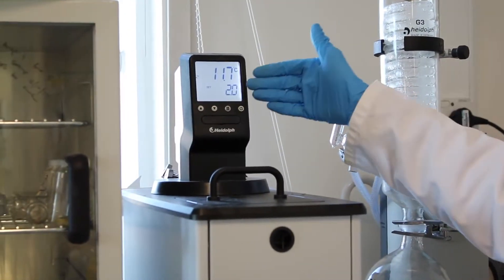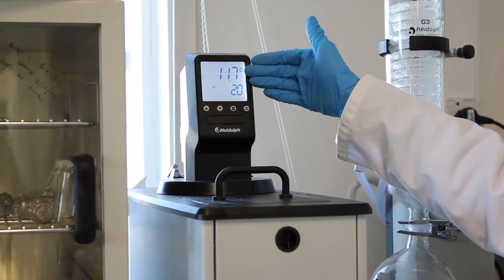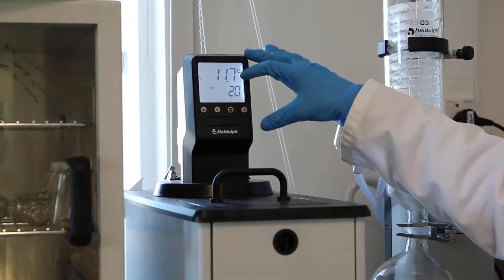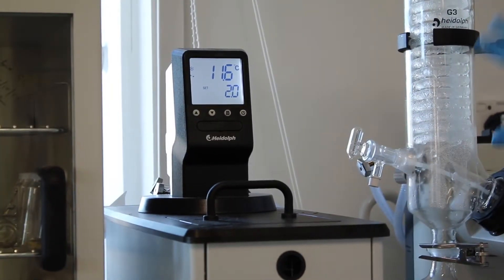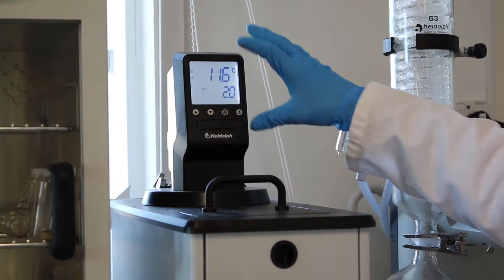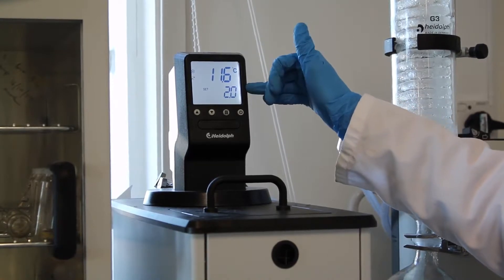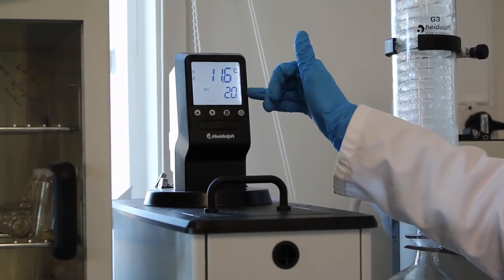Now the chiller is set at 2 degrees and the temperature of the bath, of the liquid inside is now 11. Before using the instrument, we need to wait for the temperature to drop to around 2 degrees.